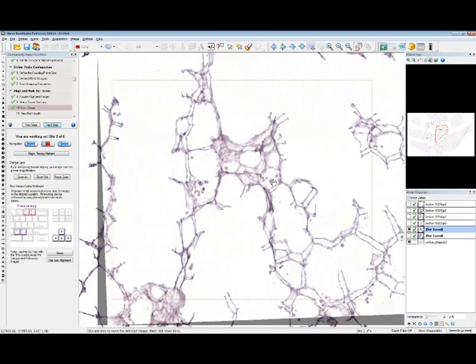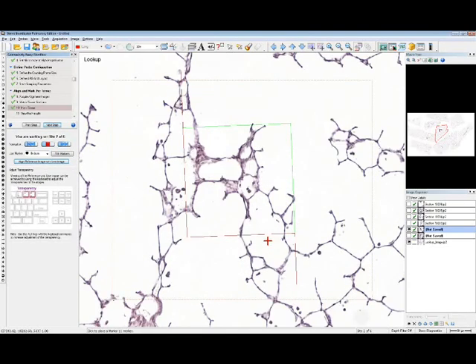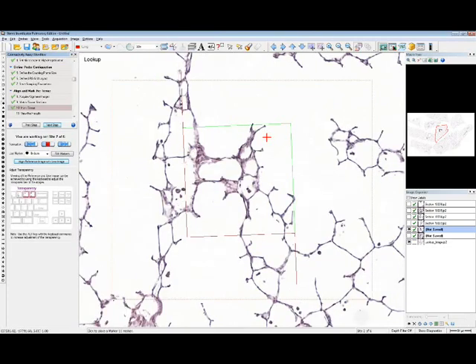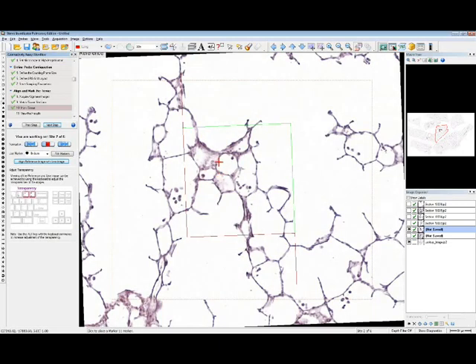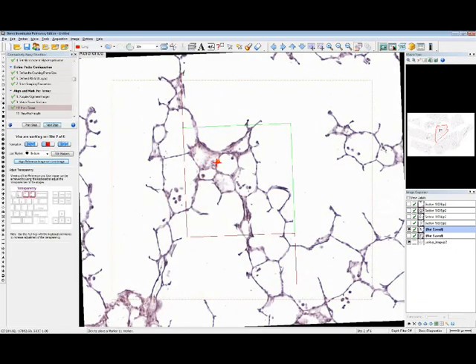And again, you're going to go through and try to line things up the best way you can. We again go to begin placing markers. And we can again switch back and forth. And now we can see over here in the center, we didn't have this connecting, but here we do. So we put at least one bridge. And there's actually more.